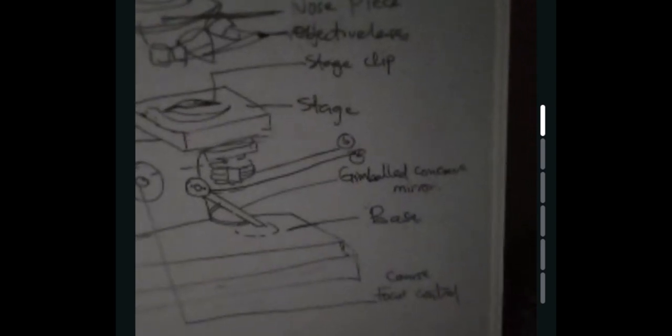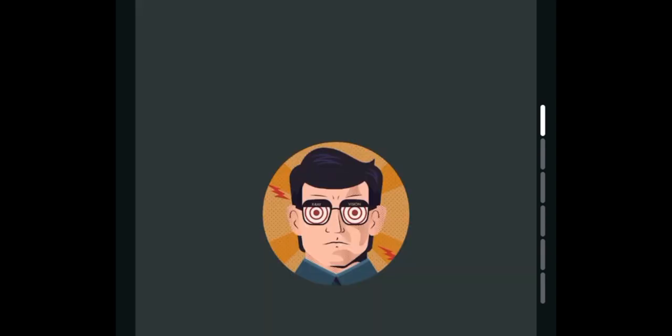And this circular thing, what is it? Let me say it is number 6. We have the mirror. I already labeled the mirror. Okay, that's the condenser knob.